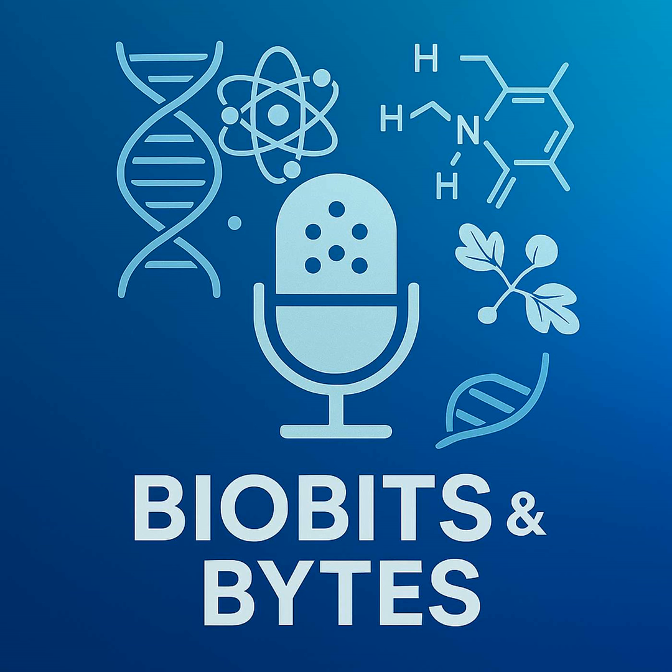For listeners maybe not so familiar, what exactly are these blotting techniques? Can you give us a definition, sort of the core idea? Sure. So at its heart, blotting is about taking biomolecules, DNA, RNA, proteins that you've already separated, usually by size, on a gel, and transferring them onto a different surface, typically a membrane. This membrane holds them in place, immobilizes them right where they landed on the gel.